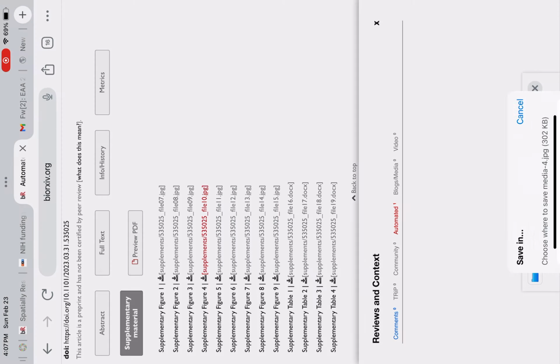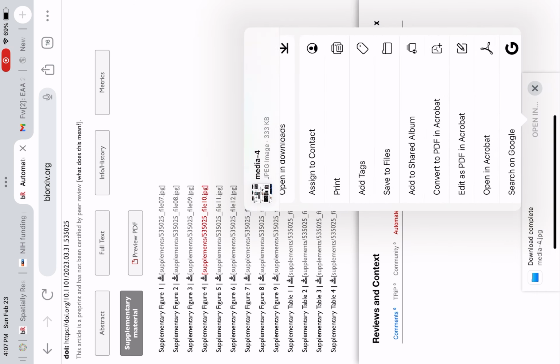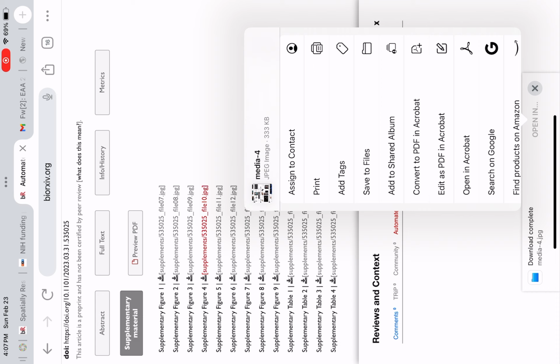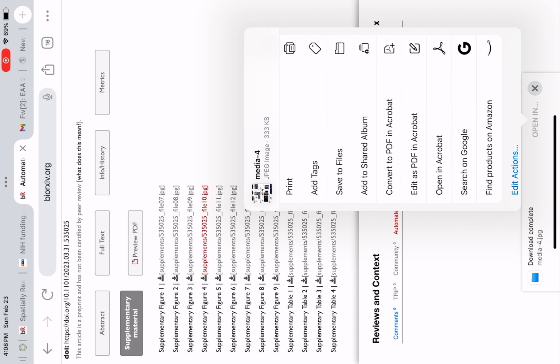Supplementary Figure 6e. If SVGs were identified using the AW, these genes are highlighted with a turquoise-colored result button for easy identification. Supplementary Figure 6b. Superimposition of other metadata, such as H&E staining or clustering results from Leiden or spatial clusters calculated in the AW, is facilitated for enhanced data interpretation.